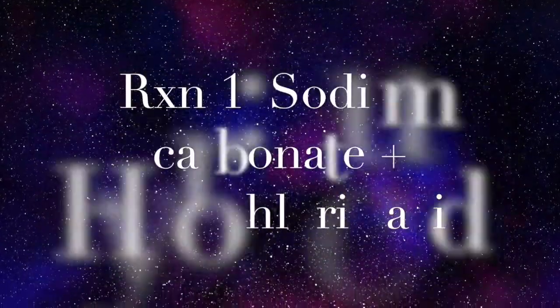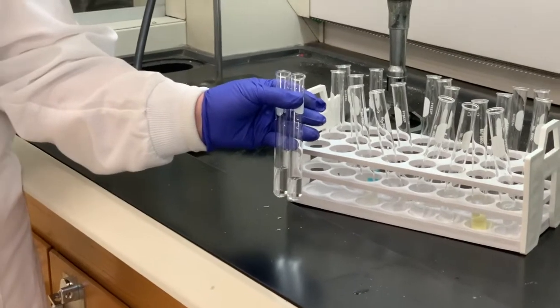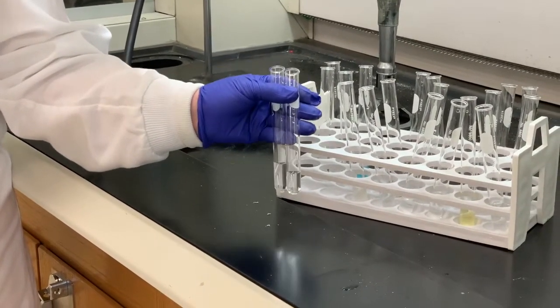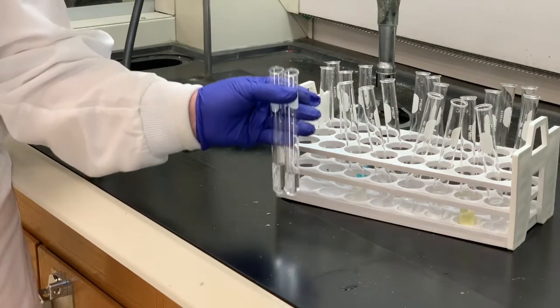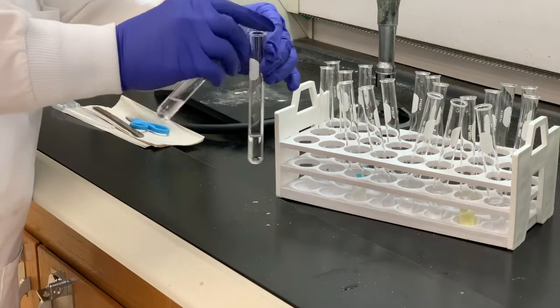The first reaction we're going to do is between sodium carbonate and hydrochloric acid. Notice the aqueous solutions. So we've got the sodium carbonate dissolved in water and the hydrochloric acid, so two colorless solutions. So I'm going to add one to the other and we'll see what happens.